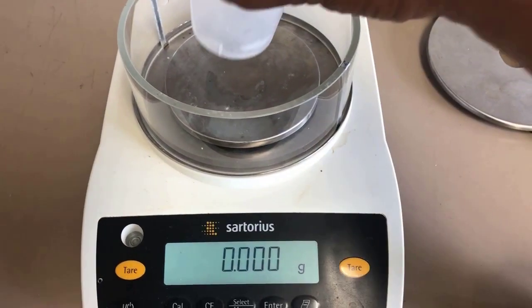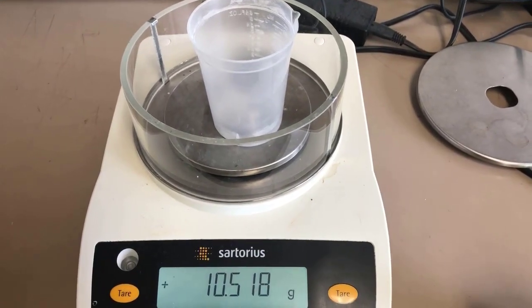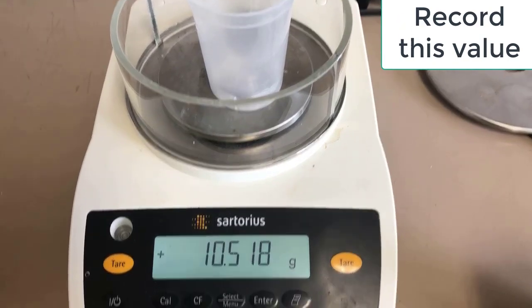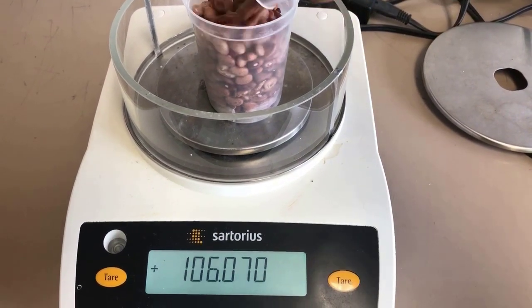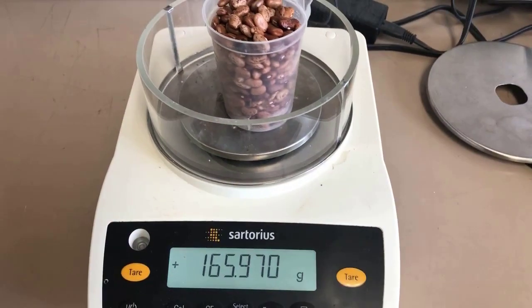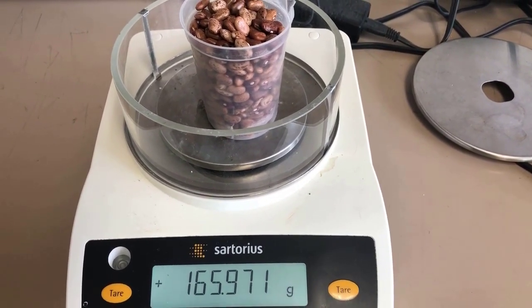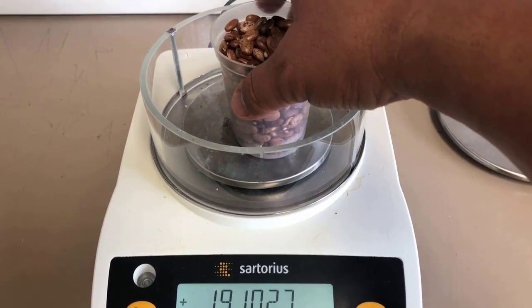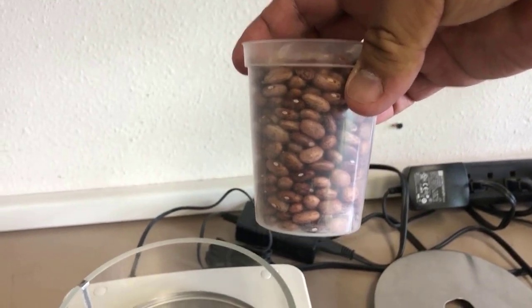We're going to see how close we are by calculating the approximate amount and then counting and comparing the results. So here we are at the balance. This will be the mass of the empty cup. And now I'll add the beans to it. And that's 165.971 grams with the beans in it.